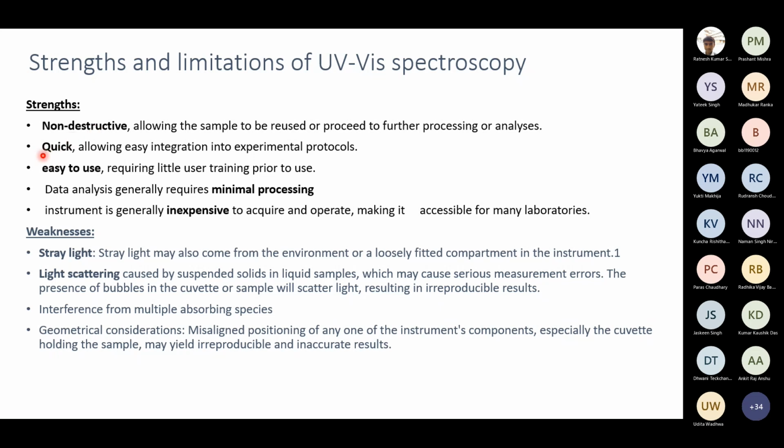The second advantage is it is quick. The analysis time is from 2 to 3 seconds. We can get a result in a fraction of time. So it is very fast to get the absorbance of our given sample.